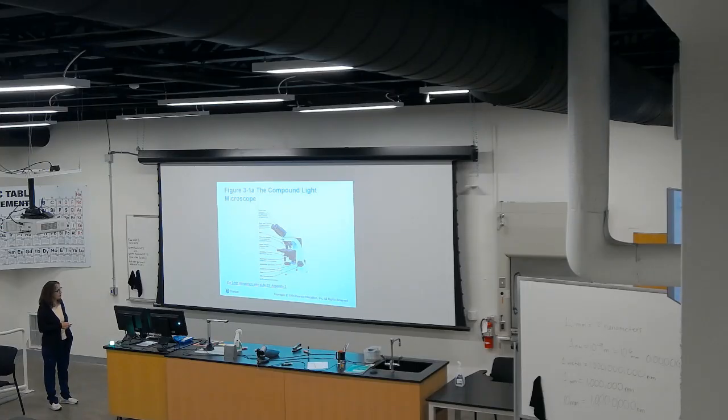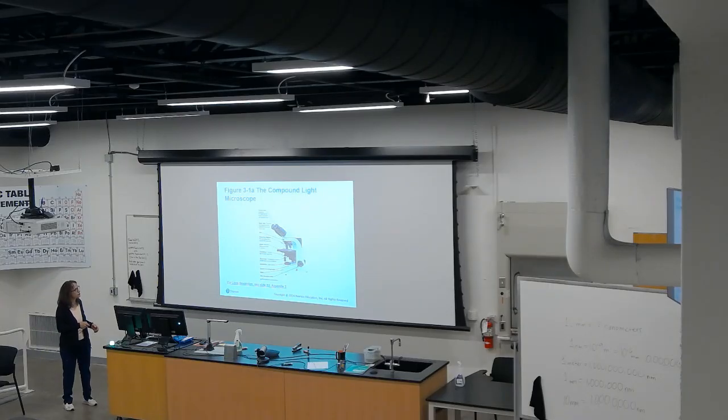So then these objective lenses are held in the tube at the tip, and they can become smaller, and they are held in this nose piece. Whenever someone is using a microscope, they are supposed to change the objective lenses by grabbing them from the nose piece.